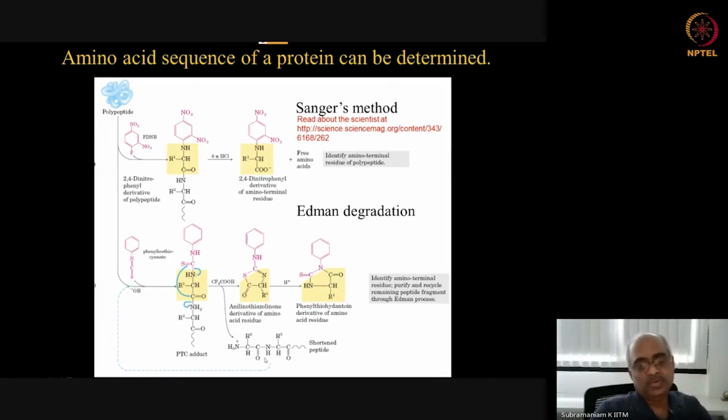So these are usually done by fixing the protein first to a solid matrix, a disc-like or paper-like matrix on which the protein is added, at the bottom of a tube. So the solutions are added, a reaction happens, and then you elute this molecule out, then you wash it, and the shortened polypeptide is still there in the matrix, then you add again.